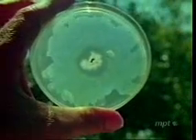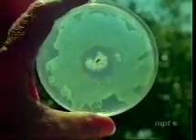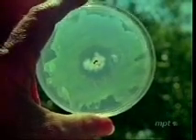If the agar is inoculated with the bacterium and a bit of penicillium is placed in the center, this is the result. There is a clear zone surrounding the growing penicillium colony. The multiplication of the bacterium has been inhibited by a substance produced by the mold, the antibiotic penicillin. In nature, the production of antibiotics allows molds to stake out a territory in which to grow and reproduce.